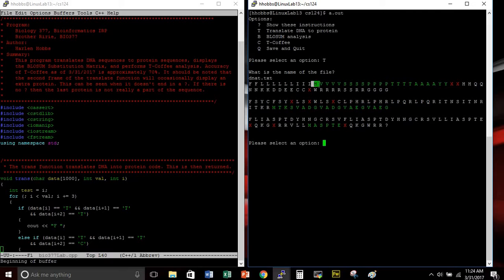Whenever you hit methionine, it starts coloring it green, which is helpful in identifying what would potentially be coded for. X's are stop codons, which would essentially cut them out. Of the three, this is the longest, and this is the only one that actually has a stop codon and is long.